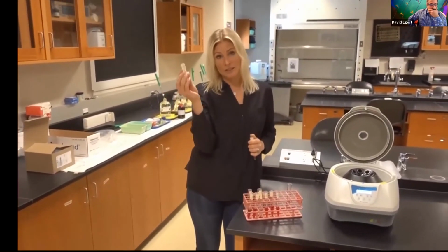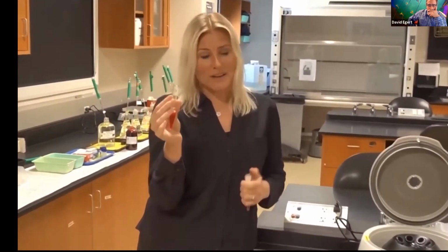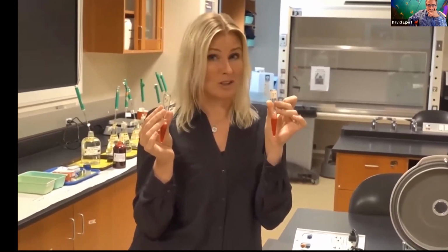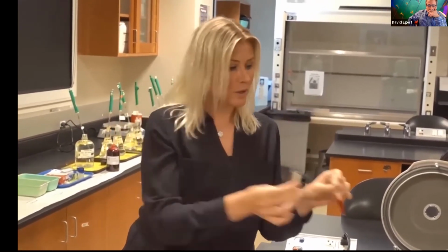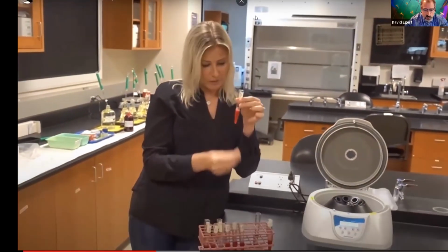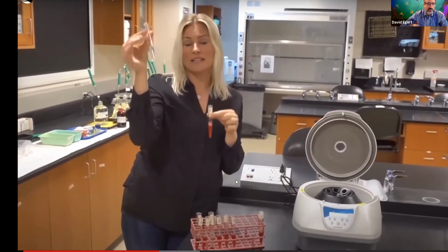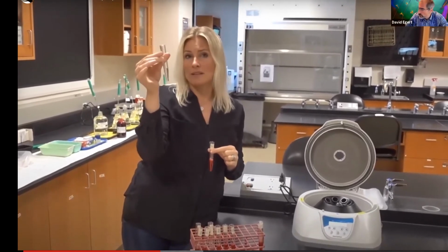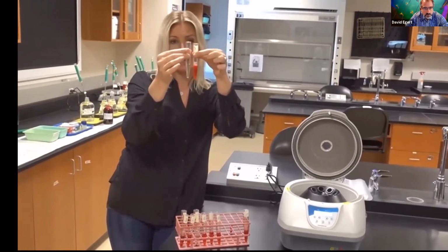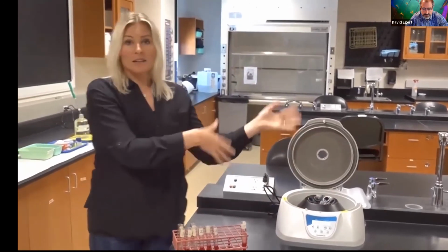you guys would only have number 9 left, which is the glycerol. But remember that we're doing a little special experiment now where we left another glycerol in for a much longer time. So I have to balance the centrifuge, but for you guys, you would only have this one. What you need to do is create a dummy tube that weighs the same. What I've done here is I measured out 3 mLs of just water, and then I added 6 drops of water to make sure that they're exactly the same. You would just put them right across from each other and do the whole process.